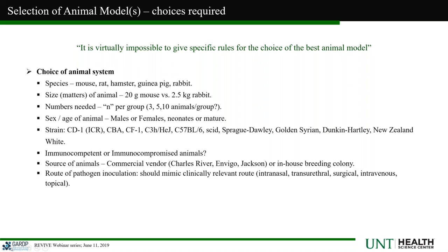There's certain cases where it's model specific. UTI in female mice is just a lot easier to run and more prevalent, more relevant. Some of your antifungal models, male mice are actually better to use. It's more reproducible. You have to worry about the age. You can use neonates, you can use mature animals.